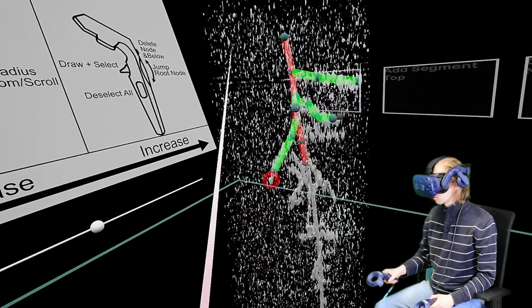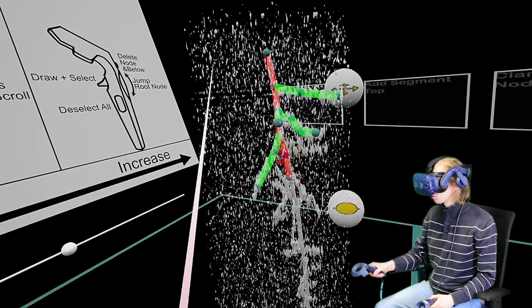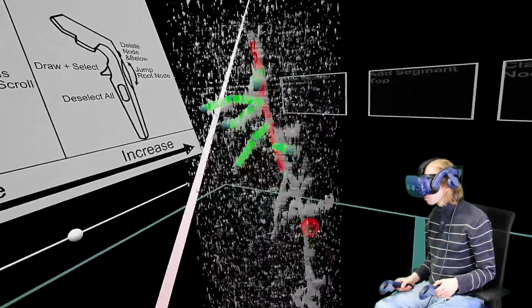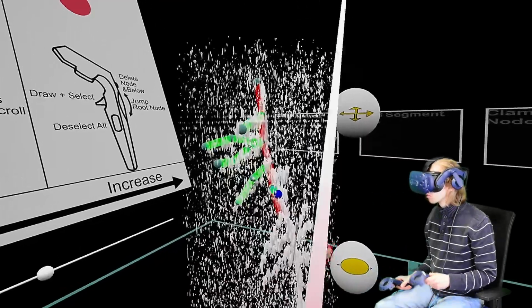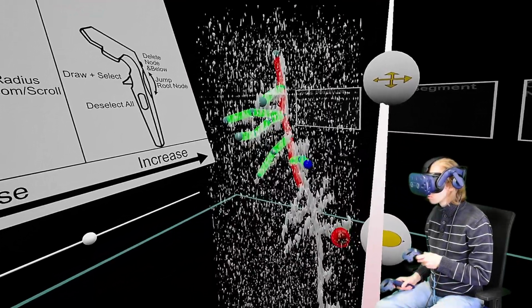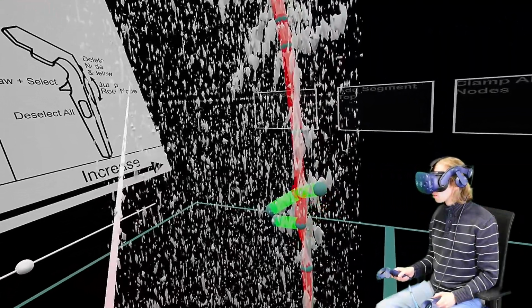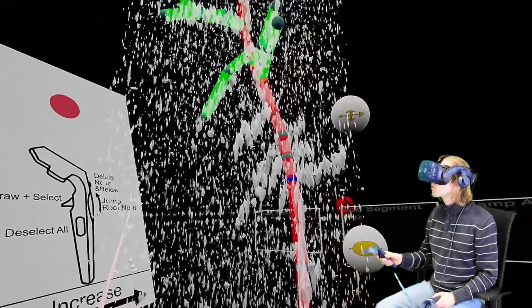Allowing users to adapt their posture according to their preferences is an important tool in increasing the accessibility of such a system. For the purposes of the user study and to retain uniformity across study tasks, we ask users to sit for the duration of the user study. This is also where the functionality of jumping the selected segment up or down the system comes in handy.